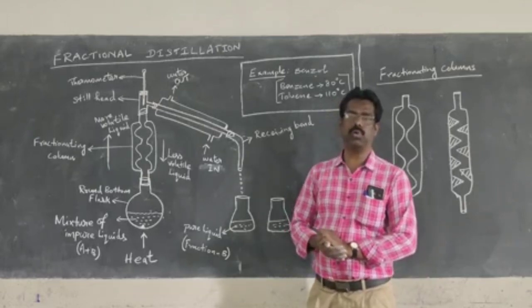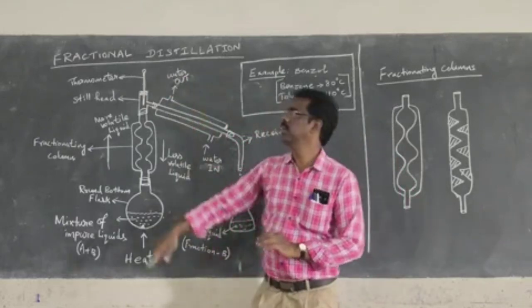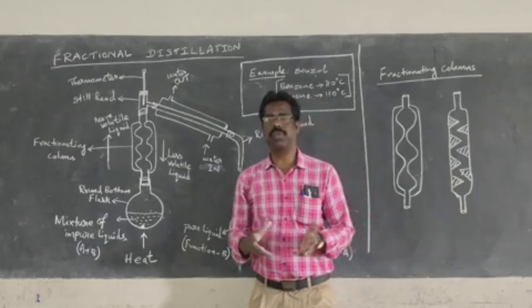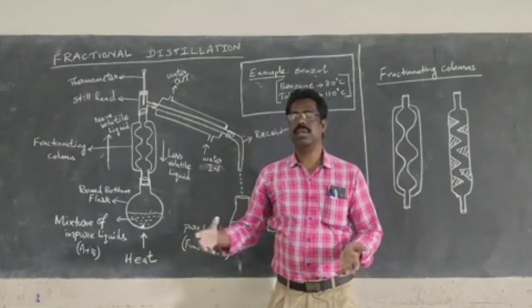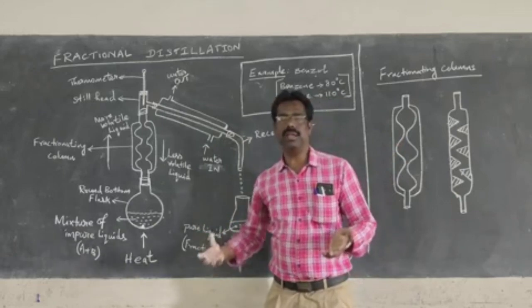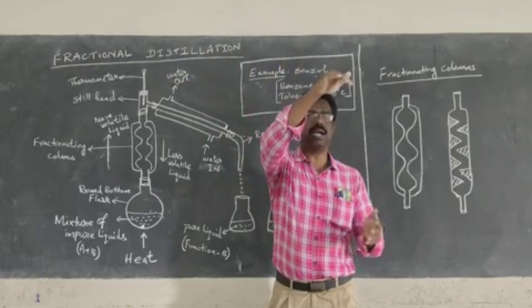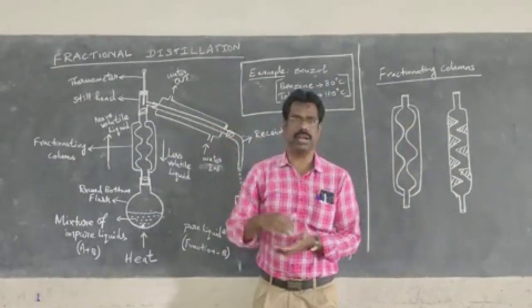In this video, I am going to explain fractional distillation. The word distillation refers to purification of any liquid by evaporation and recondensation. Any liquid, while heating, gets evaporated, and while cooling gets condensed and collected as a liquid. So this process is called distillation.